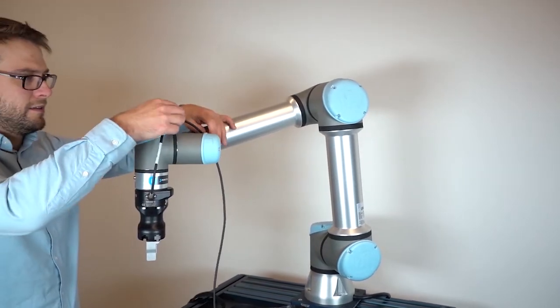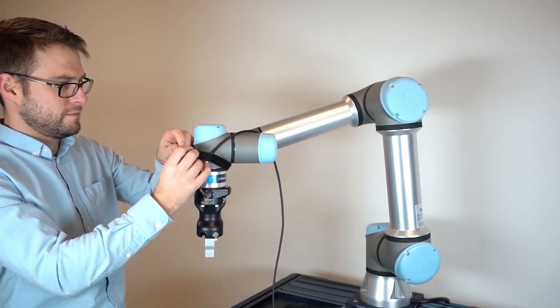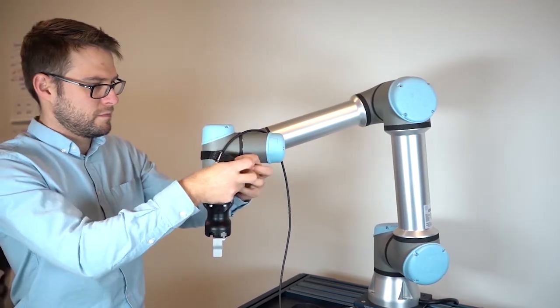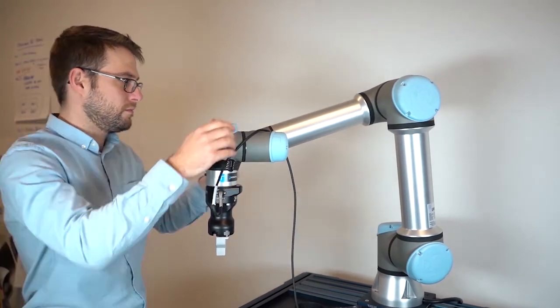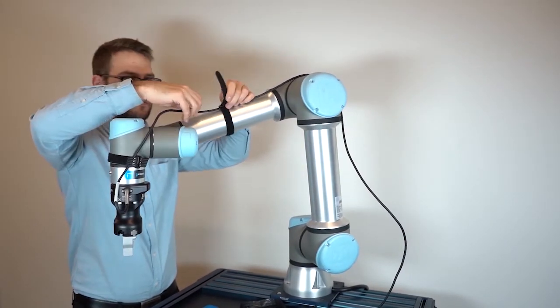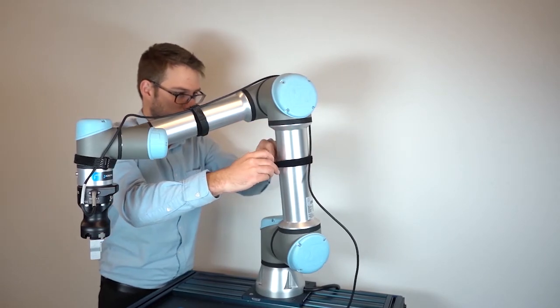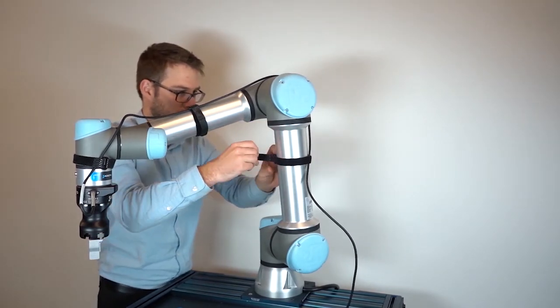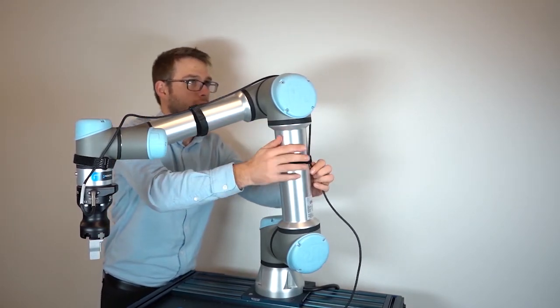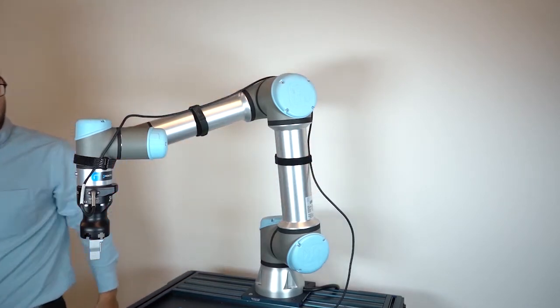Unroll the device cable and make it run along the robot arm, securing it along the way. With the remaining cable length, route the cable to the robot controller in the safest manner, so that it does not get tangled up. People could trip over a loose cord.